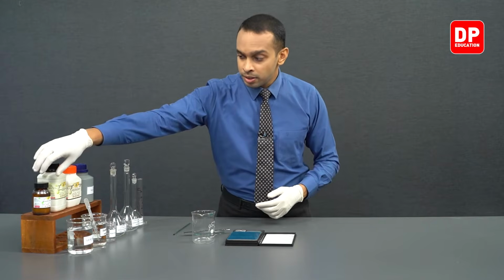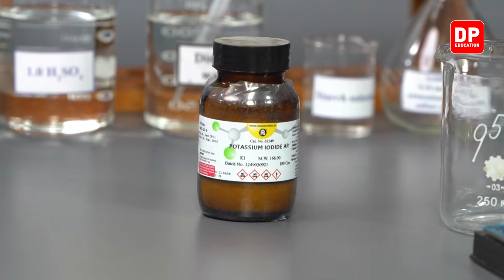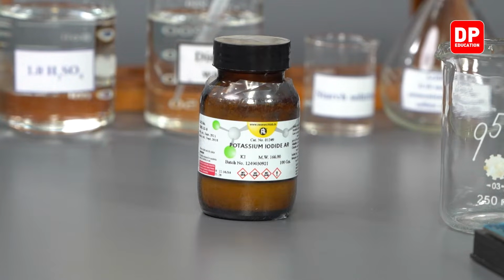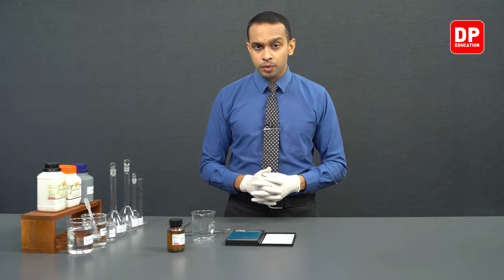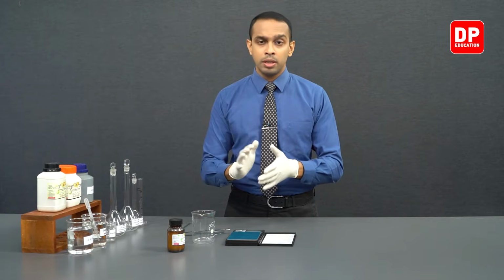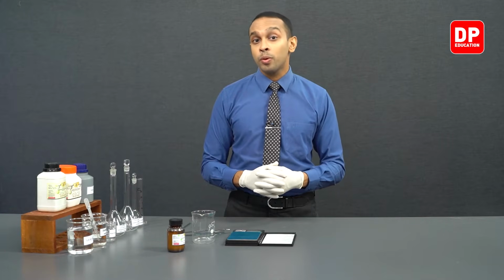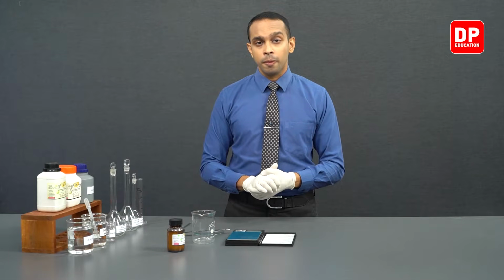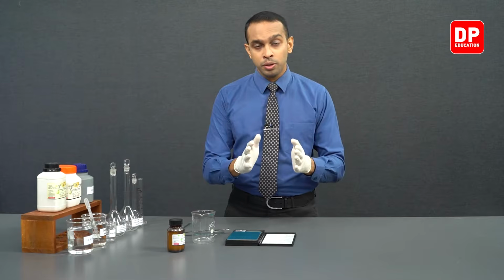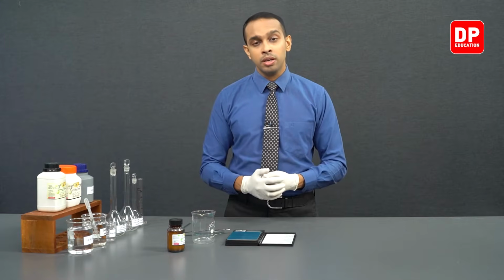So we have our potassium iodide solid here. We need to measure the correct mass of potassium iodide solid to prepare this 3.0 mol per decimeter cubed solution. Since we are preparing only 100 milliliters, we can find the number of moles of potassium iodide needed. With a concentration of 3.0 and a volume of 100 milliliters, the number of moles is 0.3 moles.